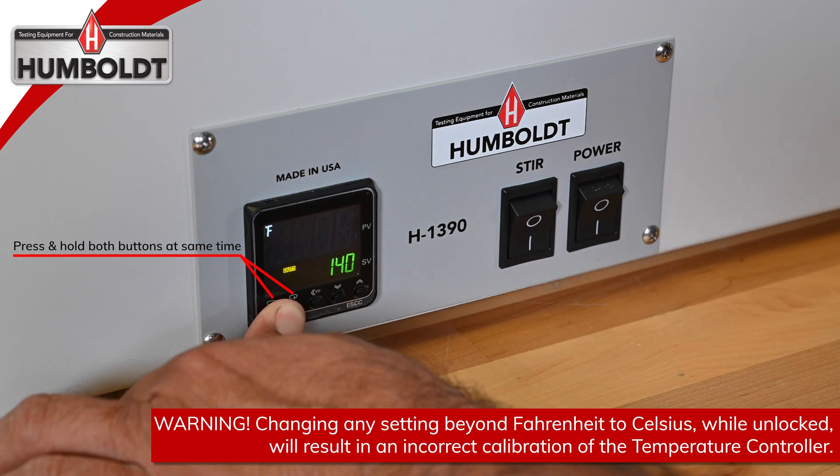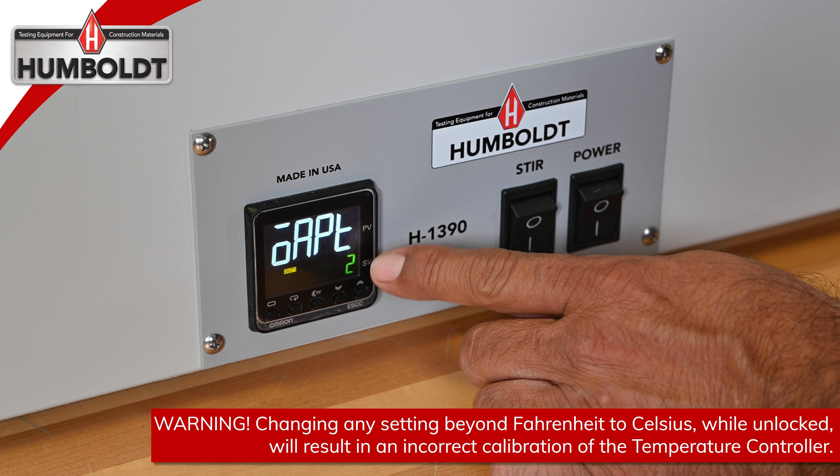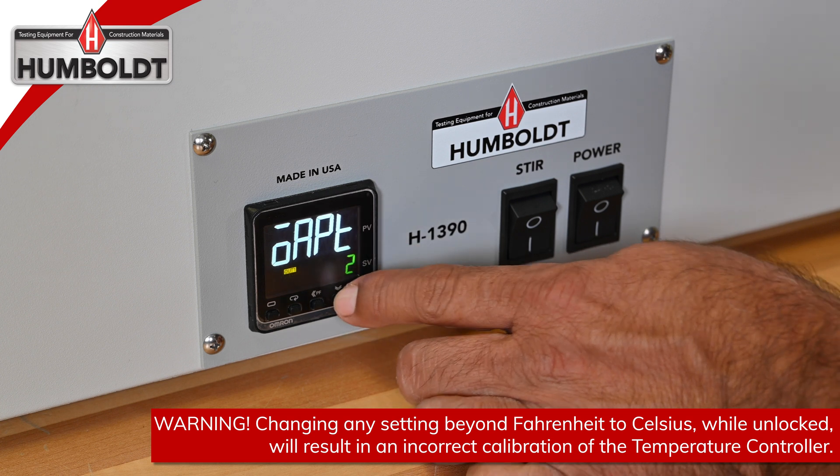Press and hold the first two buttons on the left until the controller shows OAPT with a setting of 2. Using the down arrow, change the 2 to 0.